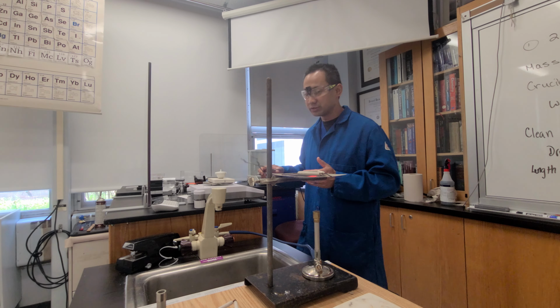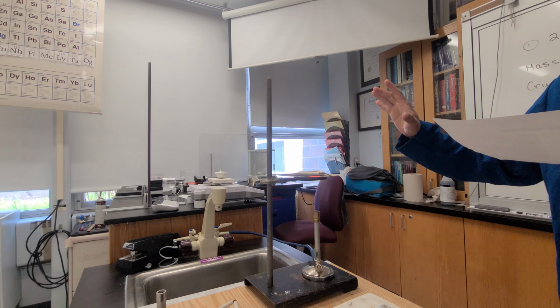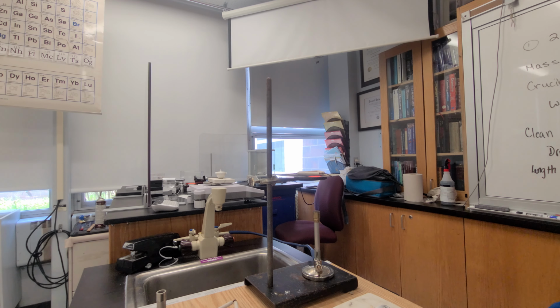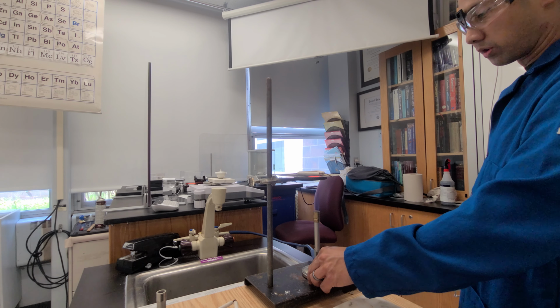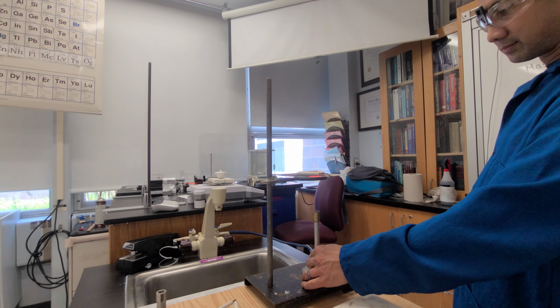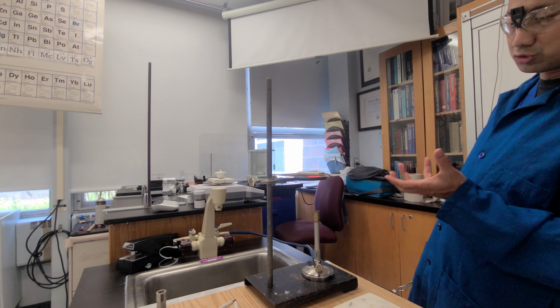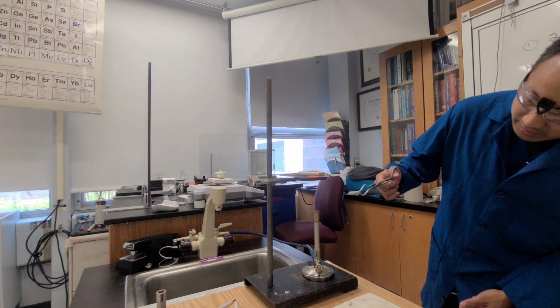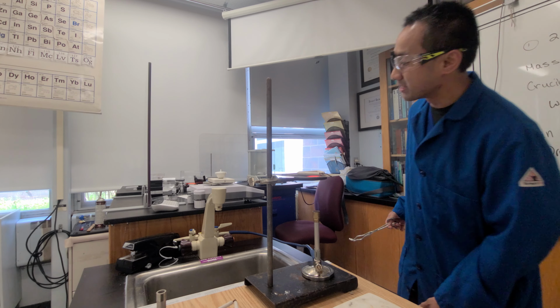Okay. So now ScholarChem tells me to start heating it up, and then leave it partially open. It does say to heat it up at a low flame. Technically not a low flame. What I can do though is open it up so it's not the super hot flame, so that the head of the flame, the highest part, is essentially not there anymore.